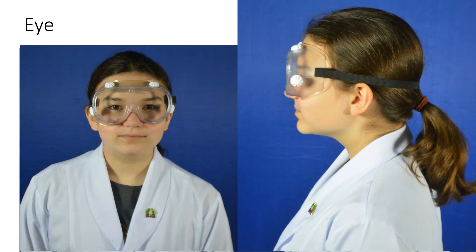These are goggles, and you can see that these fit all the way over the front. They allow you to keep splashes out and provide splash protection on the edges. It gives you a larger field of view. These are probably a little bit larger than you would want on our model. But again, these are not that expensive and are relatively easy to work with.